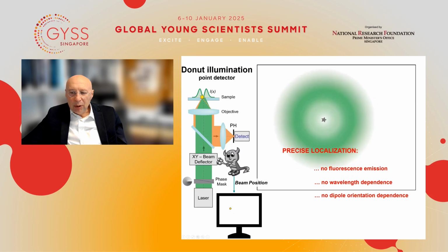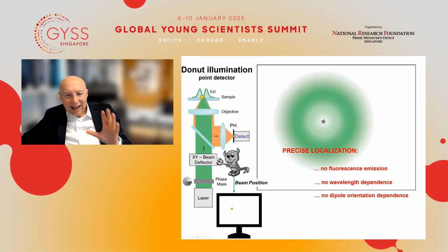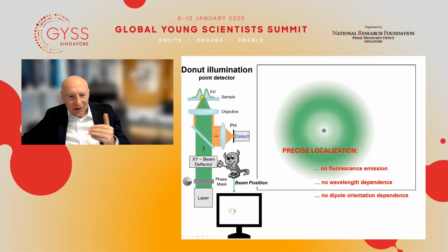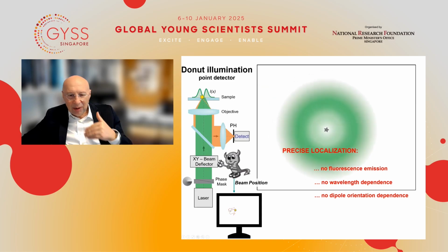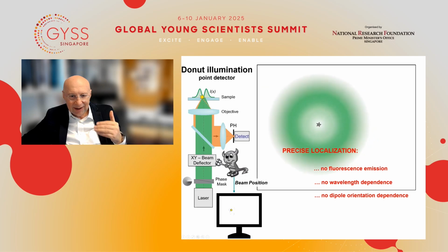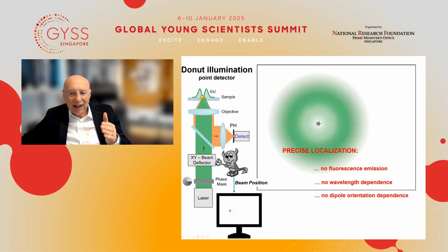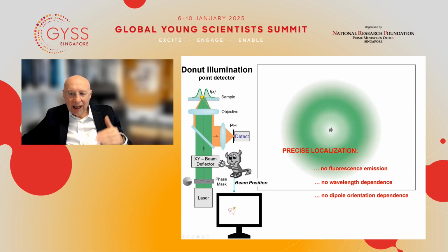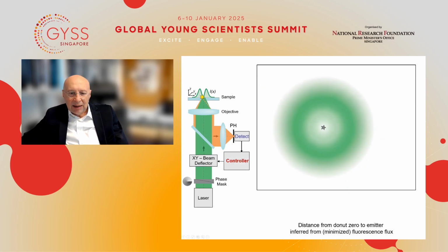Now, also the dipole orientation is gone for the same reason. Now, this is actually a thought experiment. There is no demon. It's clear that these conditions cannot be totally fulfilled in practice. There's no way. But what we could do, we can engineer the method such that we come as close as possible in reality to this ideal. And that means, in fact, that we replace the demon with a controller, with electronics.